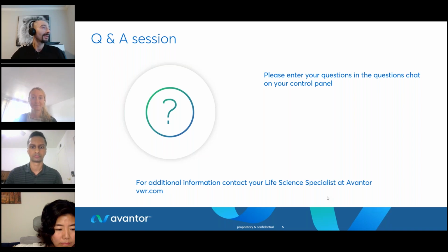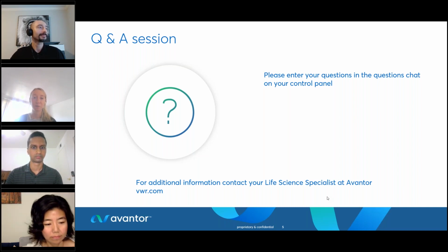Perfect, thank you. Another question is, what's the difference between giving a reference for the clone validation workflow, or not giving one? Is it just better accuracy? I'll pass that to you again, Sarah. Yeah, so as I just explained, the reference is only to do with the quality control steps at the end. The assembly that is output will be compared to the reference, but only the insert section of the assembly. It will just be used to do some extra QC steps, so it won't have any impact on the assembly itself.